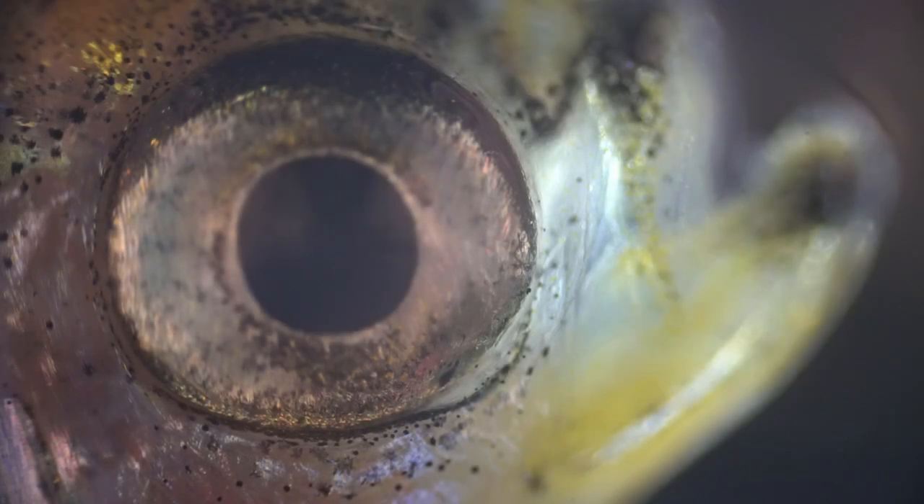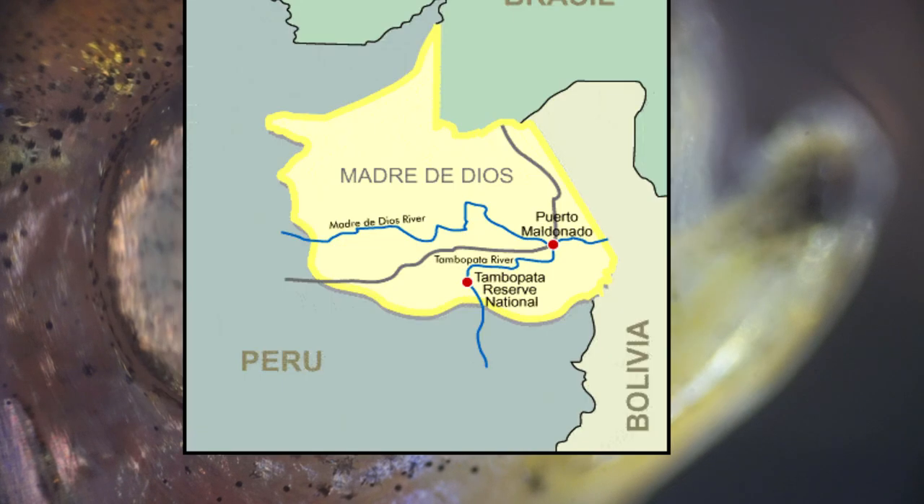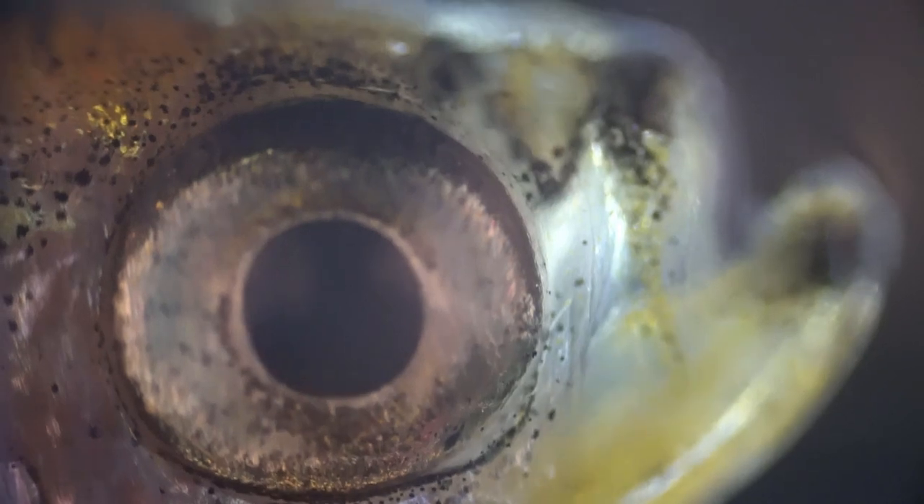We're looking at this Nano Blue Tetra — this is a Tetocharex Tamipotensis. This fish comes from southern Peru, the Madre de Dios River Basin. Freshly deceased. I believe it's one of the original wild-caught fish. It really just seemed that this fish was getting older and weaker and slowing down. I did not think it had any kind of parasite. You can see there's just a little bit of a laceration or an ulcer — this looks like it was just rubbing itself on the substrate because it could no longer swim properly. This doesn't really seem to be any kind of a parasite.